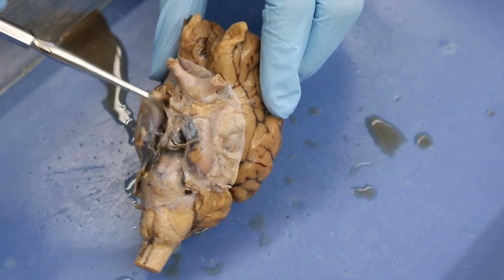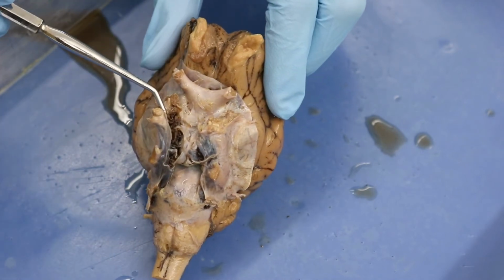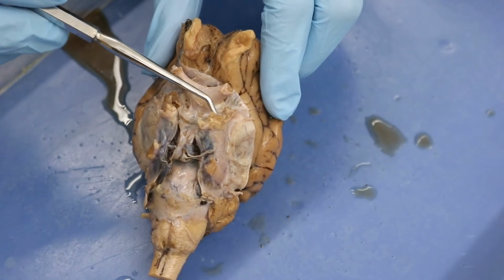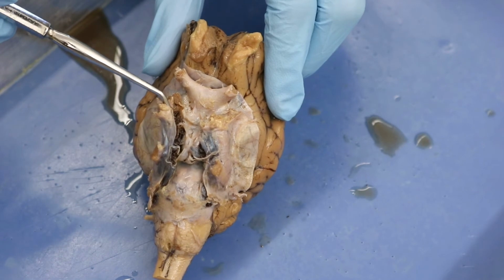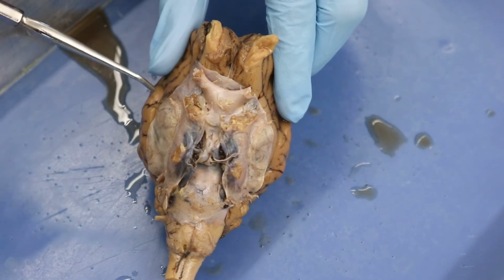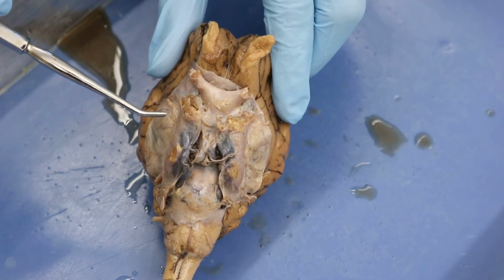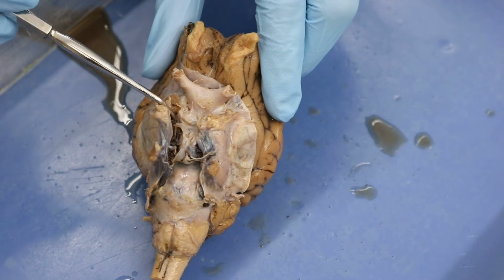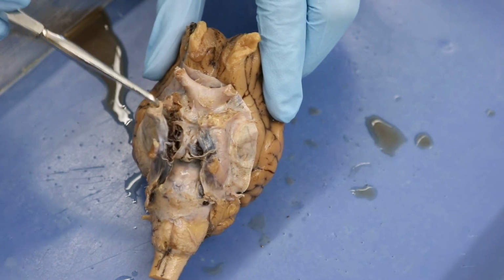Okay, now cranial nerve 3 I think is buried under here. Same thing with cranial nerve 4, but this really big guy here on either side that has been cut off would be cranial nerve 5, the trigeminal nerve. Now how do we know that? Trigeminal nerve is huge, okay? And so this huge guy is on either side, all right?